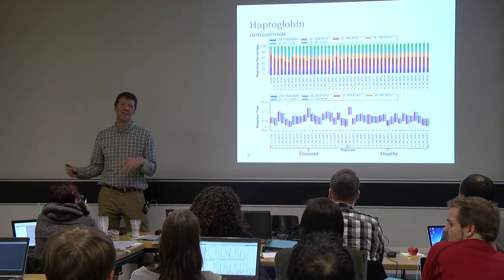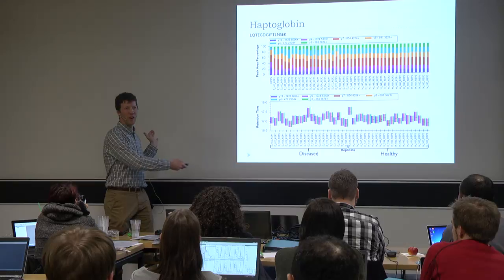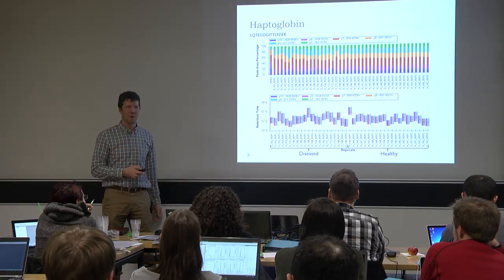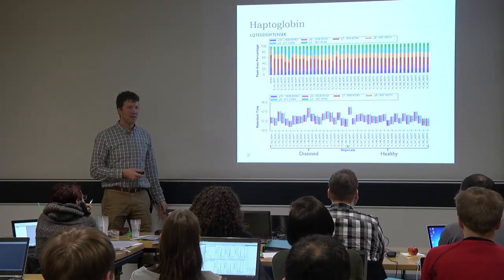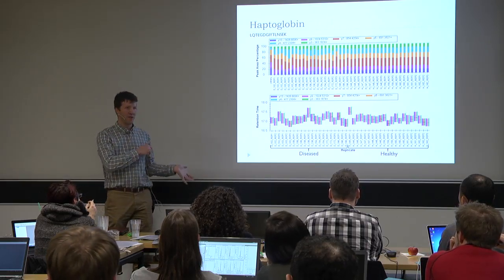What would we like to see when we get rid of this logical grouping in terms of ordering? What would be the best ordering for these replicates? As you said, the order of the measurement. Because then if you see an increase over time, that's okay, I would say. So what would be the ideal order of measurements for these replicates?